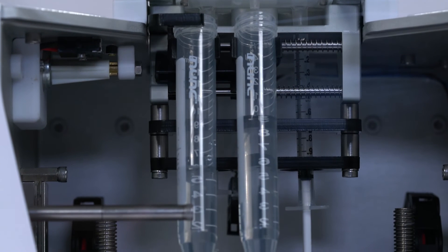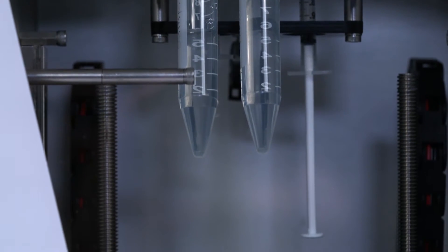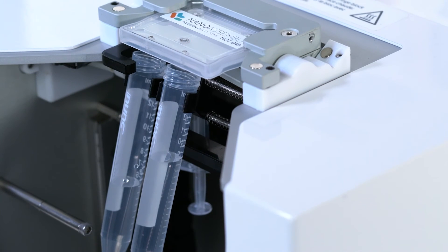The Benchtop instrument and the microfluidics technology was originally designed to manufacture nucleic acid lipid nanoparticles. It expands the range of compositions in your particle that you can prepare and allows you to rapidly scale these systems.